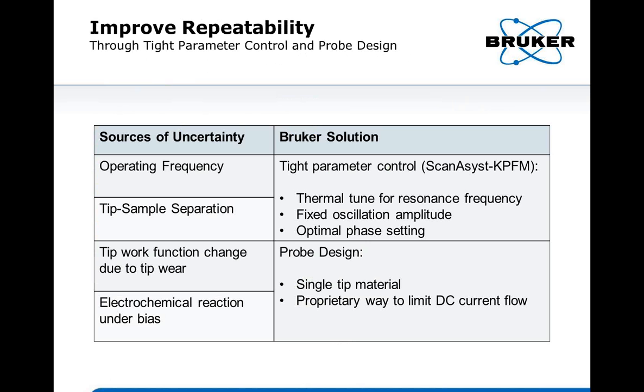So again, let's come back to our aim. Our target is to have quantitative KPFM measurement. Now we talk about spatial resolution. We know you need to have a high spatial resolution so the measurement will be accurate. But the other criteria is how repeatable the data is.